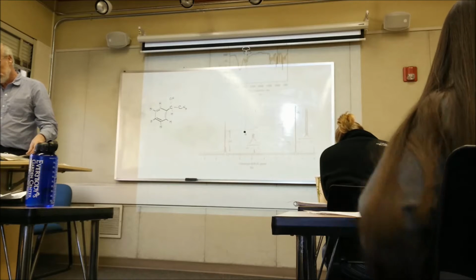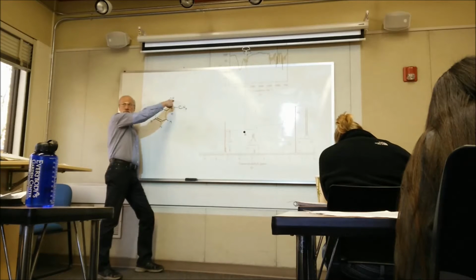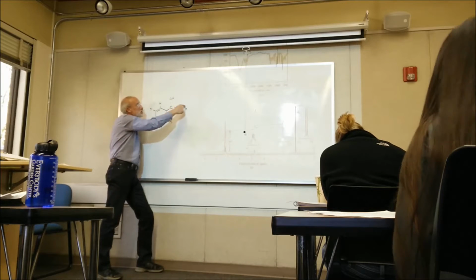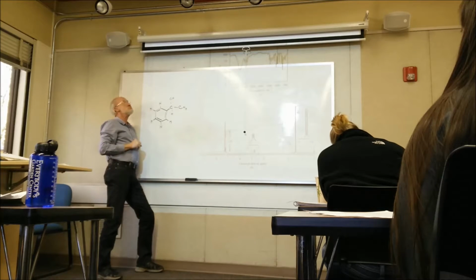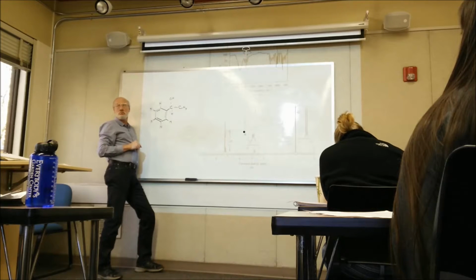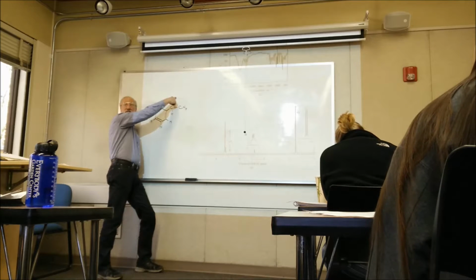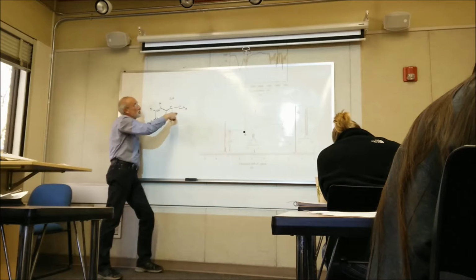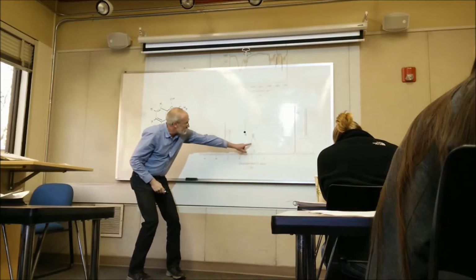So just to confirm, the hydrogen that's part of the alcohol is only being split by its direct neighbor, which is the carbon directly below it. Now, if this were a double bond, there would be a small amount of splitting between here and here, but it'd be really, really tiny. It would still be less than the single hydrogen on that carbon being split by the same methyl group, right? Yeah, this thing is going to split that normally, assuming this is not coming on and off fast enough. If these things are coupled, this will be a doublet, and it'll split this into a doublet, but this is also being split by these 3. So each peak of the doublet is being split into a quartet. Okay. Mess. Okay.